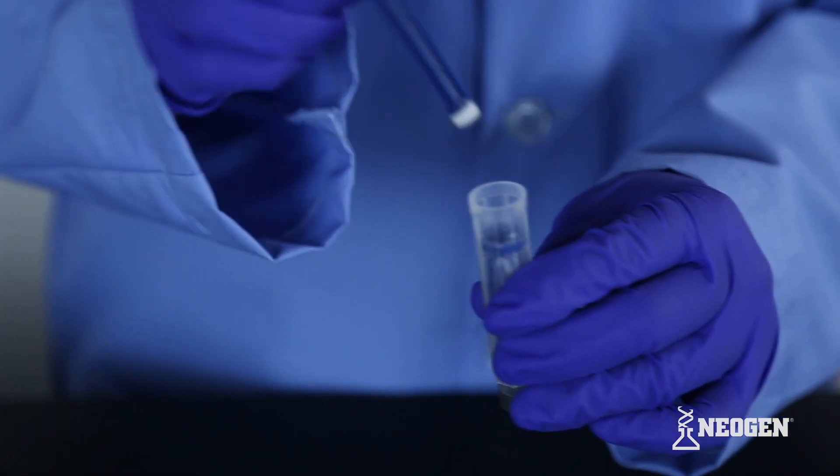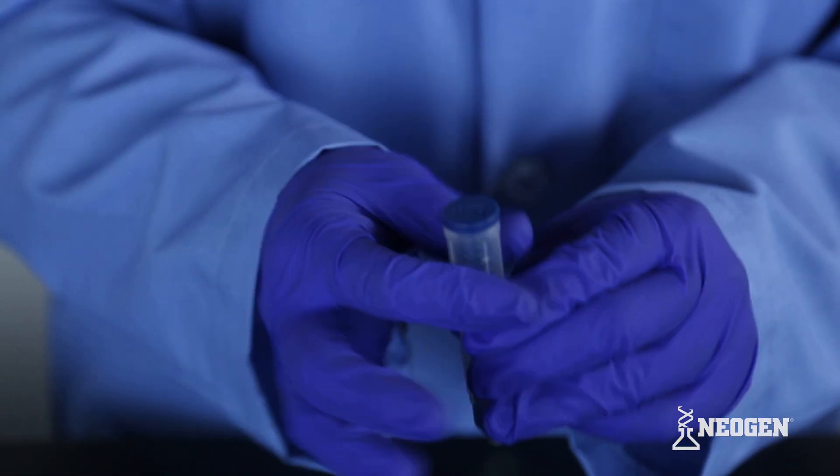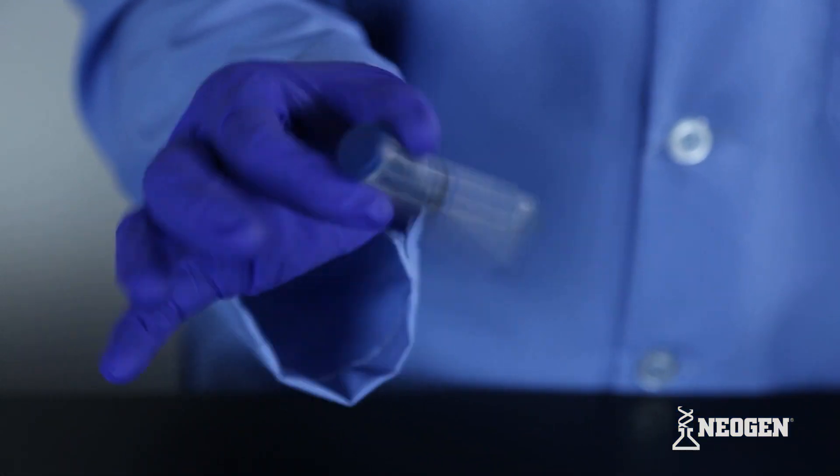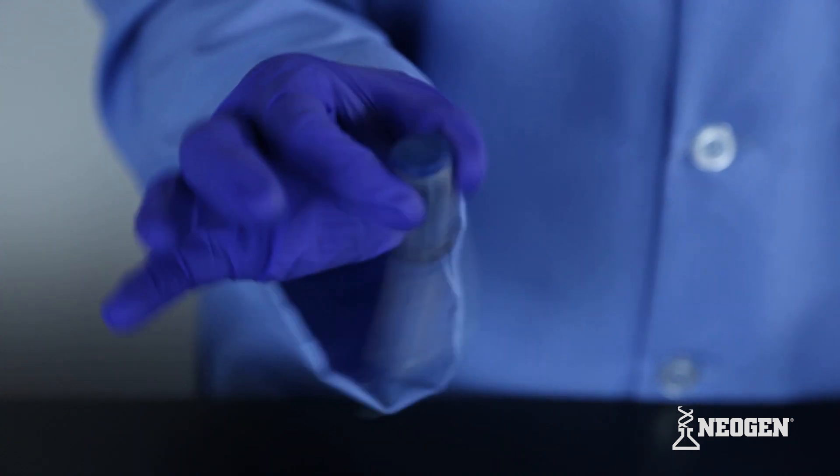After taking your sample, return the plunger portion to the sampling device. Activate by pressing it fully into the cartridge and shake the cartridge side to side for 10 seconds.